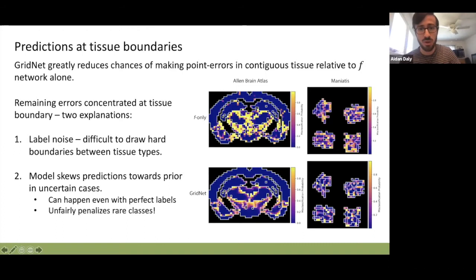In each one, we show the tissue in this Space Invaders-like view, where every pixel is a spot in an ST experiment, and regions between tissue types are colored in as white outlines. Every pixel shows the probability of misclassifying the patch, basically the sum over all the incorrect classes that is output by the model.